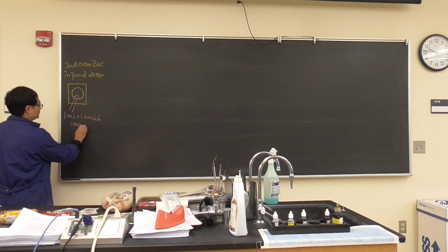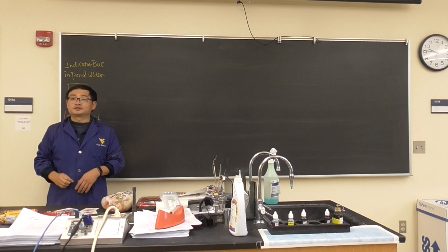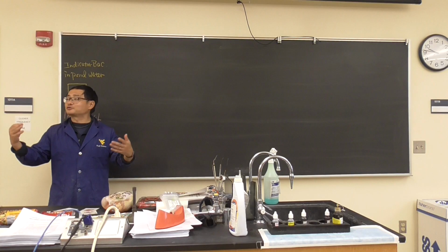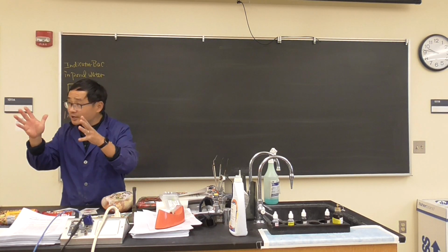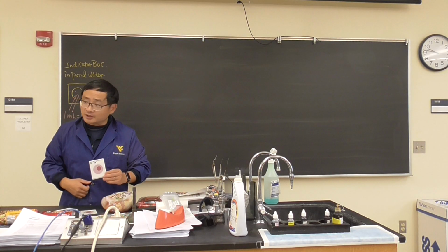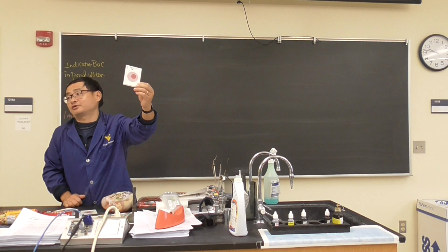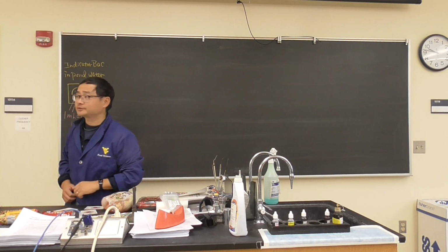100 microliters. I told you to do that. Yeah, that's what I said. That result looks weird. So this is to give you some experience for the future. When you ever work in some place and you see a petrifilm done like that, the volume is incorrect. You added 100 microliters. Now what is correct?